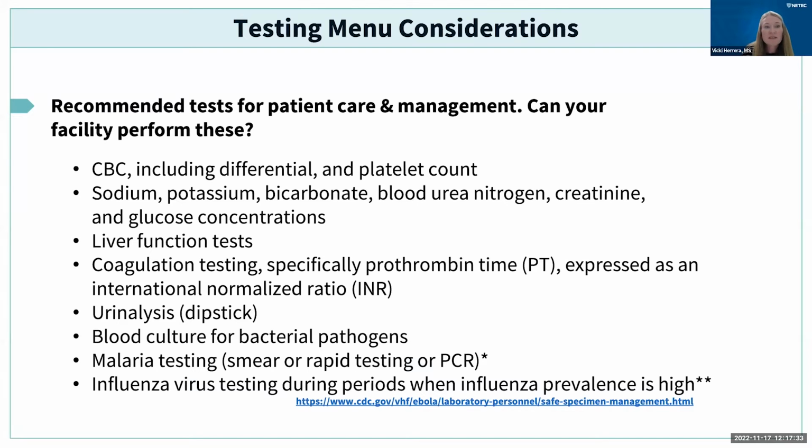CBCs, basic electrolytes, liver functions, coag testing, urinalysis, blood cultures, malaria testing, influenza testing. And this slide is a little bit behind because we now have a huge surge in RSV. COVID is also there. So respiratory testing might be on the differential, depending on where you're at and what's circulating at the time.